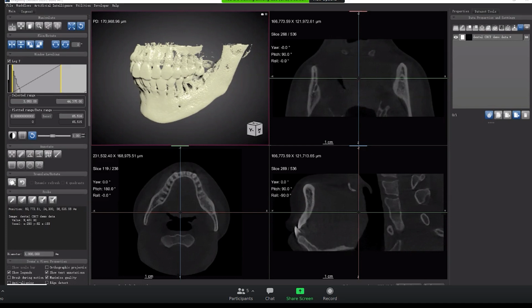I will show you how to use deep learning, particularly the segmentation wizard, to train a model for your image segmentation task. The main point is to demonstrate the workflow. I will try to help you do the same thing on your computer and make sure it works for you. And I'm sure you will have many questions.